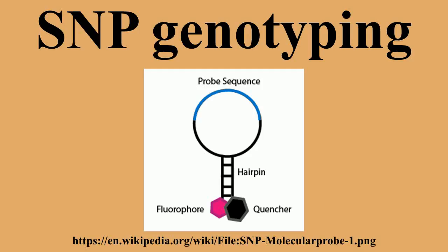However, in its original format, only one SNP allele could be interrogated per reaction sample, and it required a large amount of target DNA to generate a detectable signal in a reasonable time frame. Several developments have extended the original invader assay by carrying out secondary FEN cleavage reactions. The serial invasive signal amplification reaction allows both SNP alleles to be interrogated in a single reaction. The SISAR invader assay also requires less target DNA, improving the sensitivity of the original invader assay.